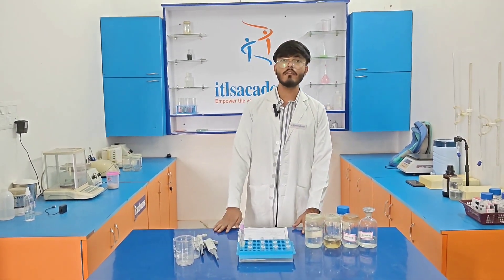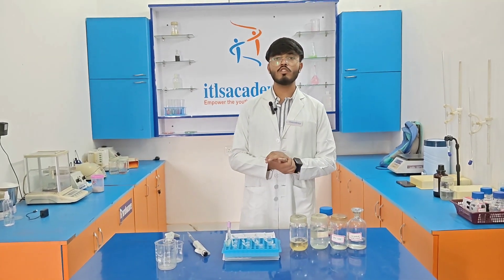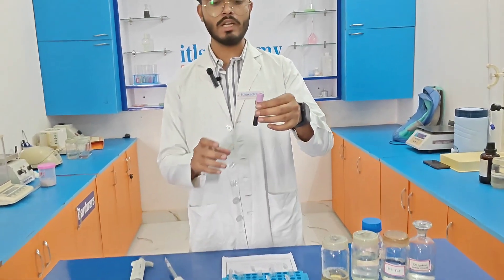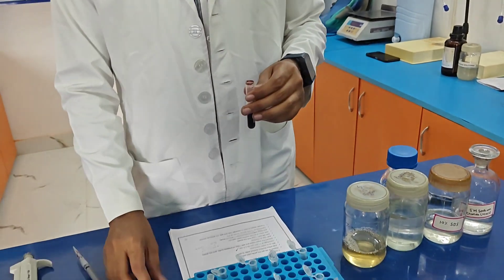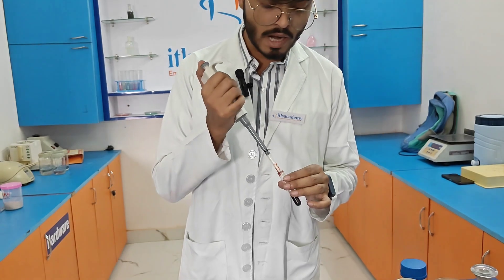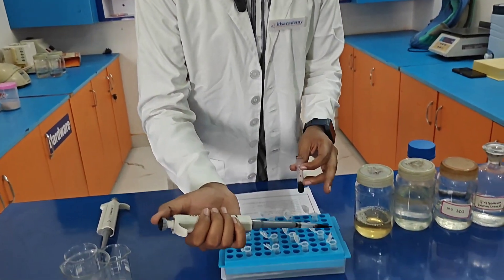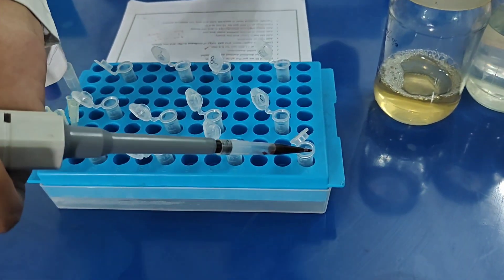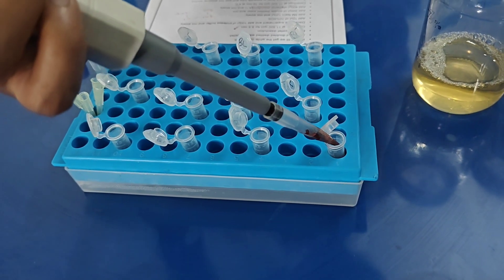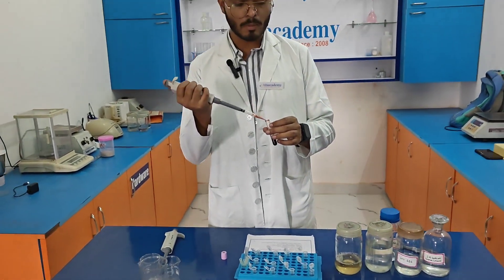Now we are going to perform the isolation of DNA from the human blood sample. We already collected blood from the laboratory. Using a micropipette, I pour 0.5 ml of human blood sample into each eppendorf tube. After adding the blood, we need to add 0.5 ml of lysis buffer to each eppendorf tube and mix it properly.